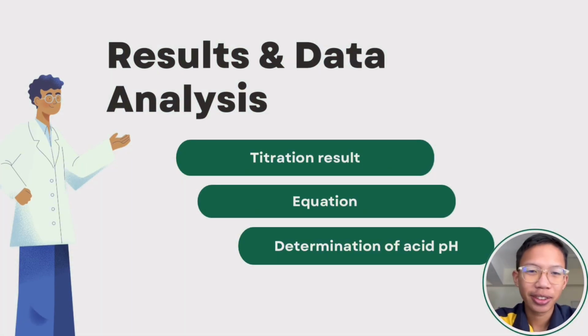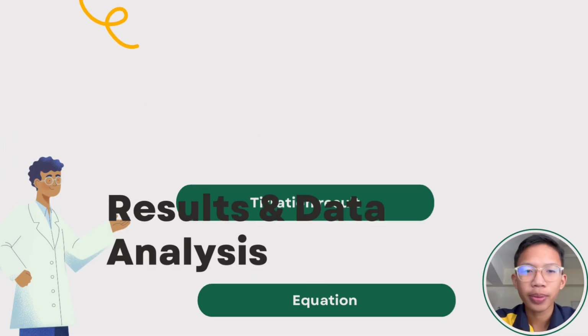Hi everyone, today I want to present to you the results and data analysis for this experiment, which has three parts: titration result, equation, and determination of acid pH.